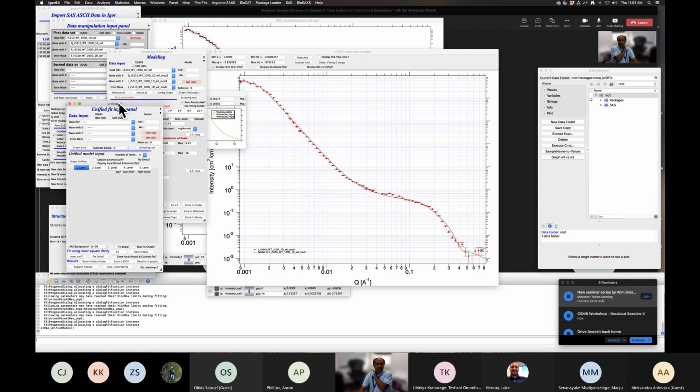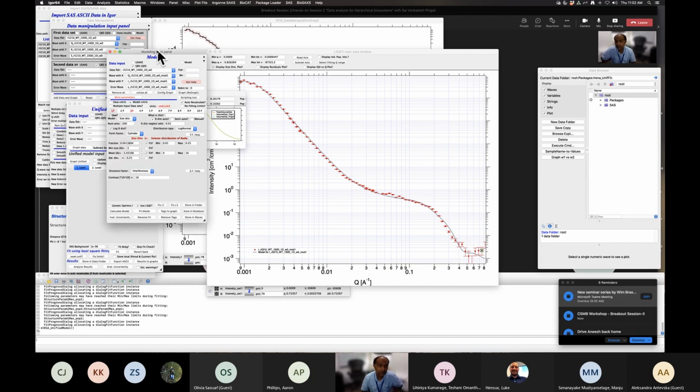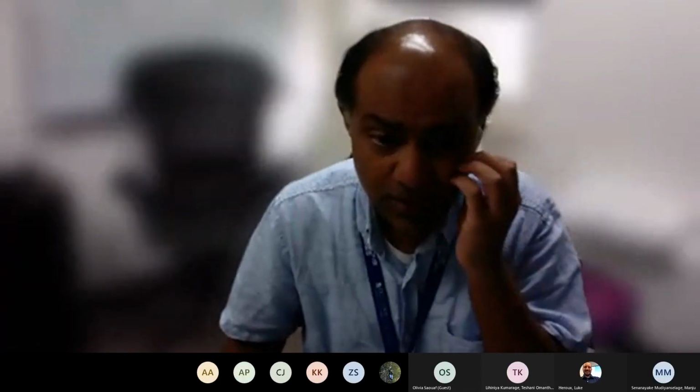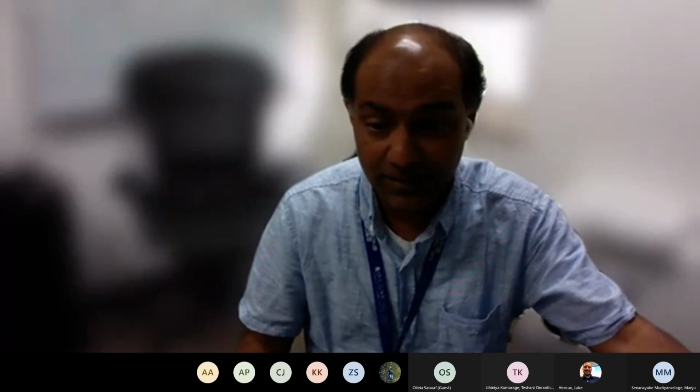If you use more isotropic patterns, then it's easier to do that. Once you go to anisotropy, usually you select out a specific shape for those strong scattering parts. Okay. I'm going to stop sharing and see what questions people will have on their system that I need to help you with.